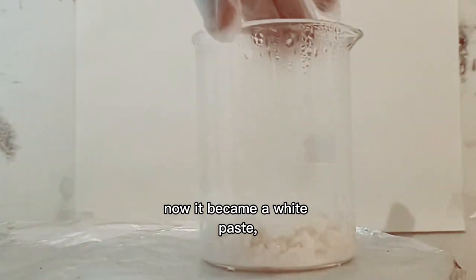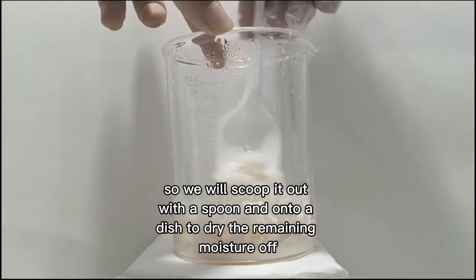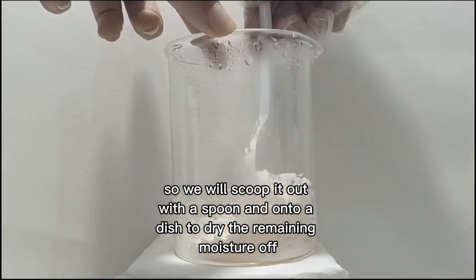Now it became a white paste — that's actually the calcium acetate we want. We will scoop it out with a spoon and onto a dish to dry the remaining moisture off.